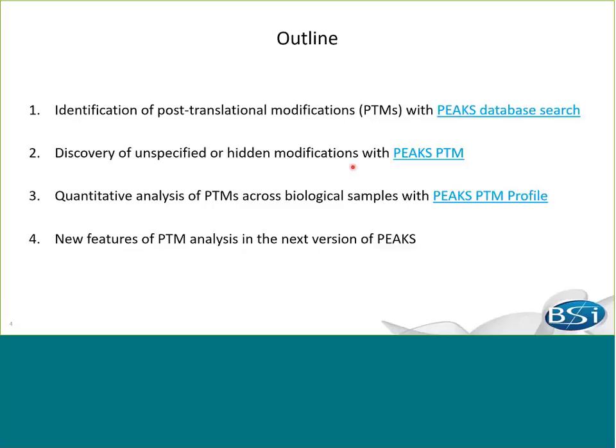Thirdly, I will demonstrate quantification of PTMs by using PEAKS PTM profile. Lastly, I will touch a little bit on some new features that are going to be integrated in the new version of PEAKS, which we hope will make your study easier.